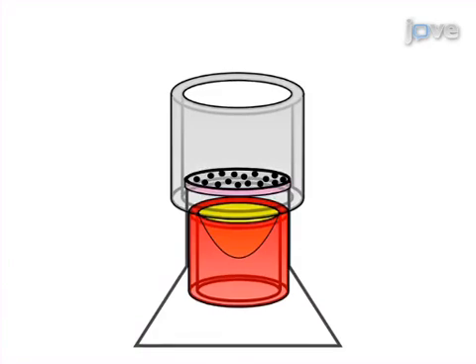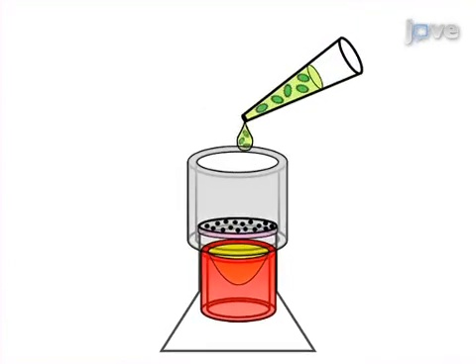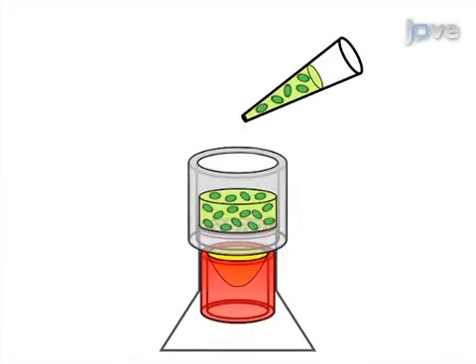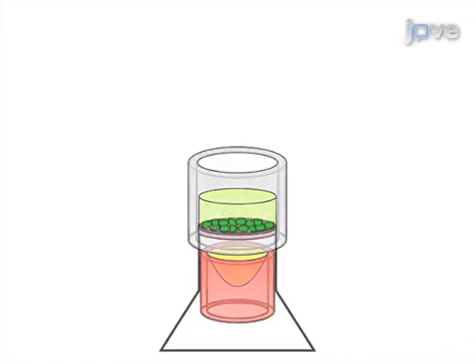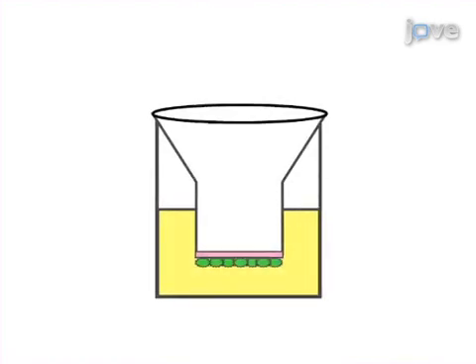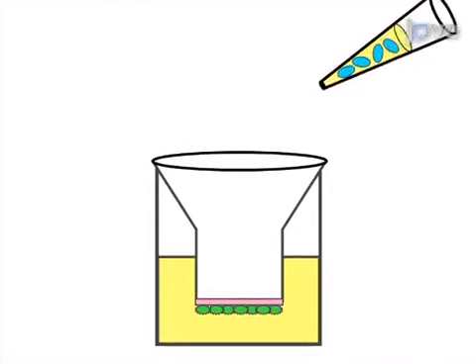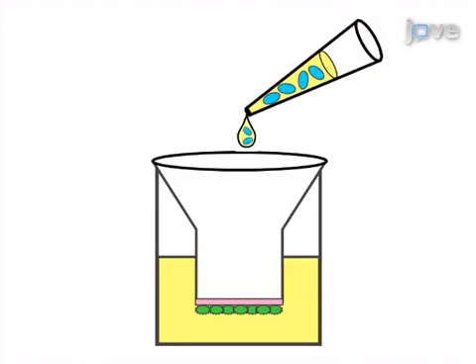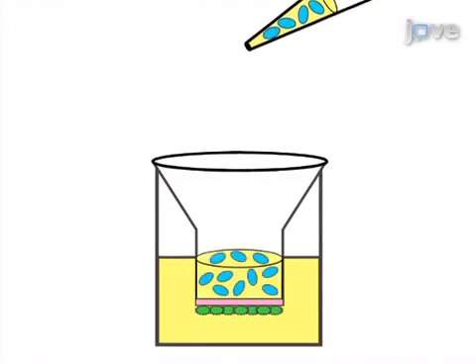Seat the astrocyte cells on the inverted insert so that they adhere to the abluminol surface. Then, remove the tubing and place the insert in its normal orientation inside a medium-filled well. Next, seat the endothelial cells into the luminal compartment of the insert and co-culture with the opposing astrocytes.